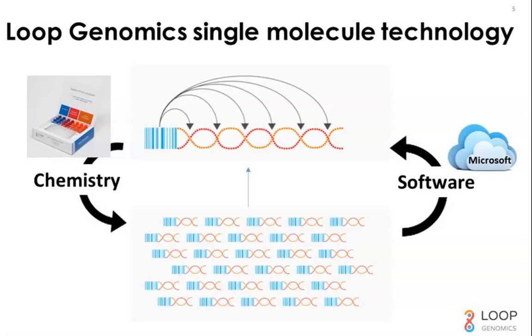Now, the structure of the short reads, shown here on the bottom, is always the same. The read always starts with the UMI, the barcode, and is then followed by the actual sequence of the 16S that was adjacent to where that barcode was inserted. So if this barcode was inserted here, the short read that results will have the barcode at the beginning of R1, and then the actual sequence where the barcode was inserted.